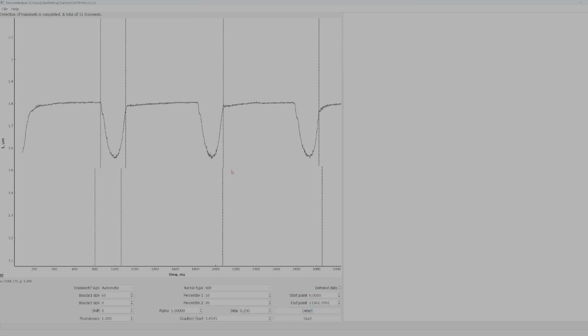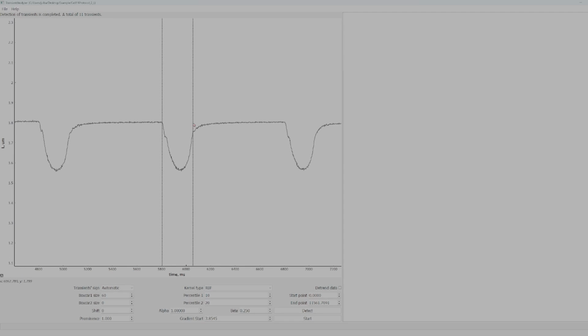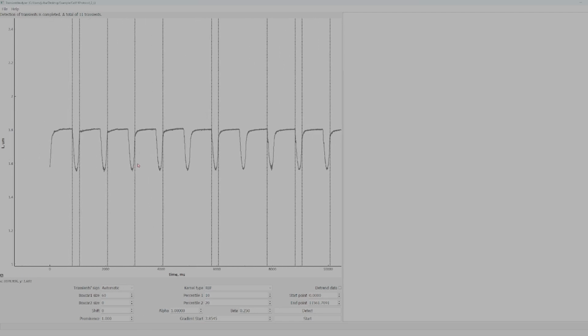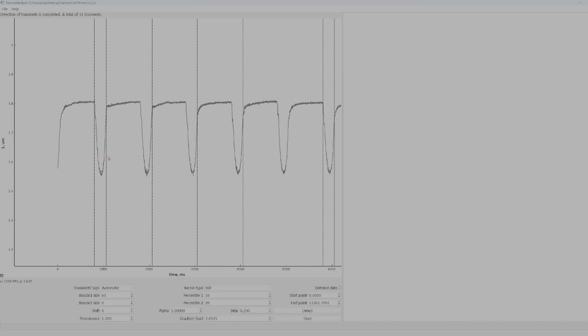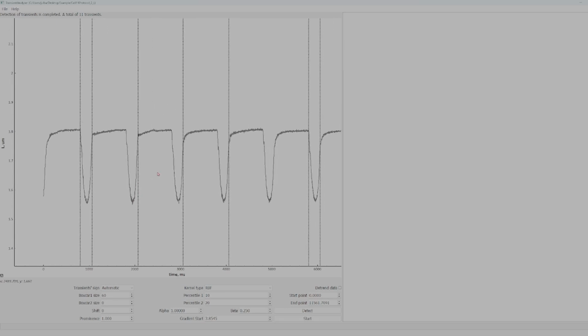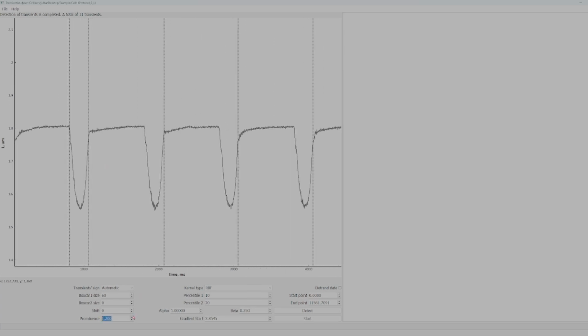Yeah. You see here in this file, it is a problem with detection because your file does not contain some points, and in this case you definitely need to use stimulation file, because if you, for example, change to negative, it won't help at all.